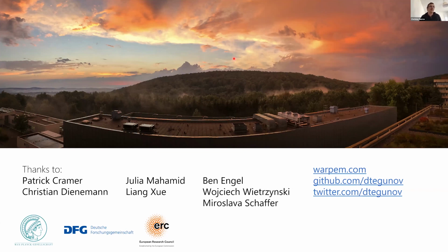So for frame series data, doming, at least in the data that I've analyzed so far, has barely ever improved anything. But this is also because we fractionate the dose very coarsely.